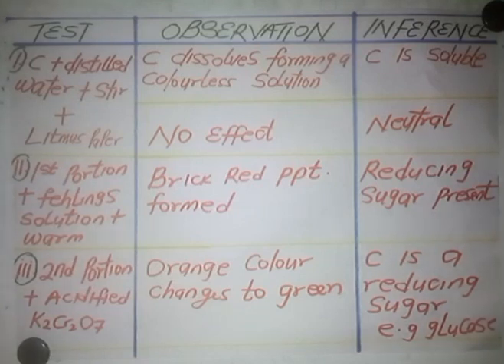So today, without wasting much time, we're going to be looking at WAEC Chemistry 2023 practical question on the qualitative analysis, or salt analysis.